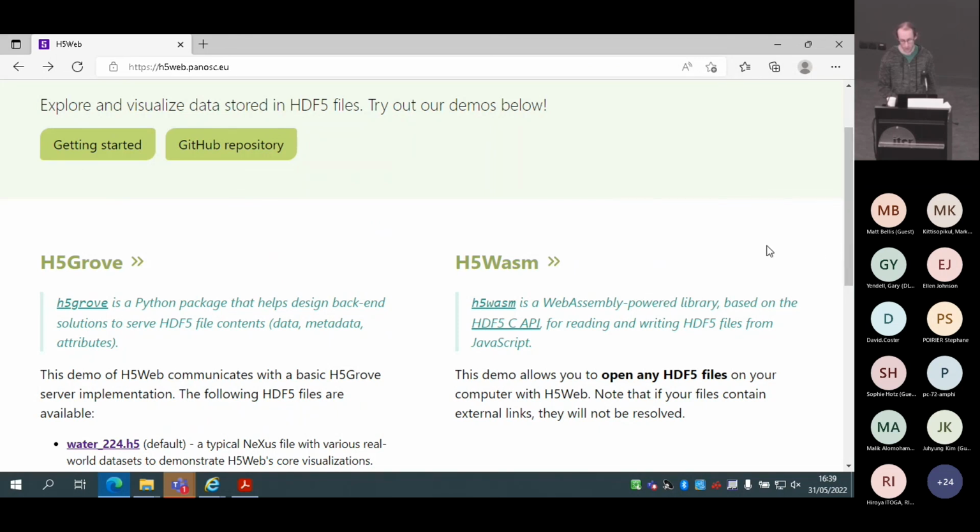Thanks. Great questions. Any other questions? I mean, it actually might work since my understanding is H5Wasm uses just the standard HDF5 library. If you open a virtual dataset and start reading from it, it should just work. Well, Brian can comment on this, but from the latest things that I saw, we display the link as an unresolved entity for now. And this is for links. And for virtual datasets, I'm not really sure. So perhaps he will have something to say about it.